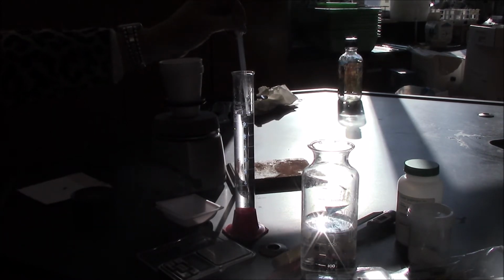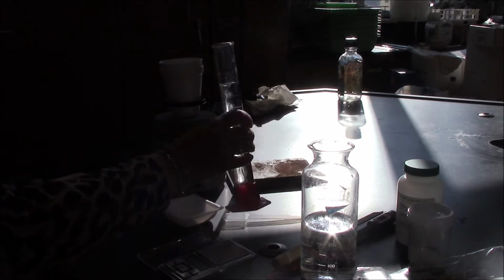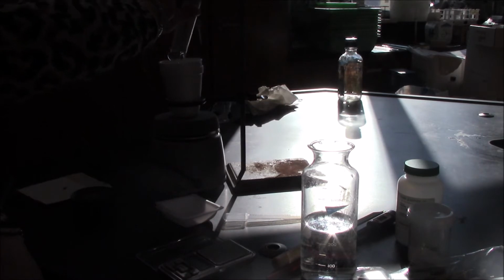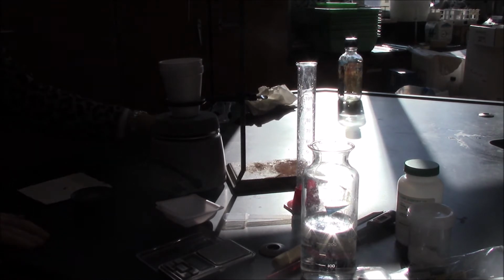All right. So the way that my graduated cylinder is calibrated, I can measure to 1 decimal place, so I can say that that is 100.0 milliliters of water. Knowing that the density of water is 1 gram per milliliter, I have 100.0 grams of water. I'm going to add this to my calorimeter, and I'm going to set my calorimeter to stir.